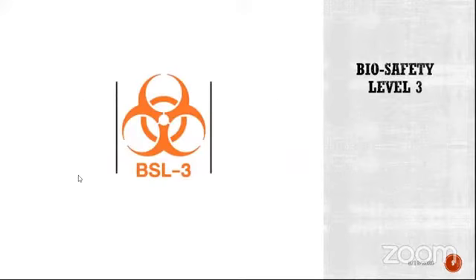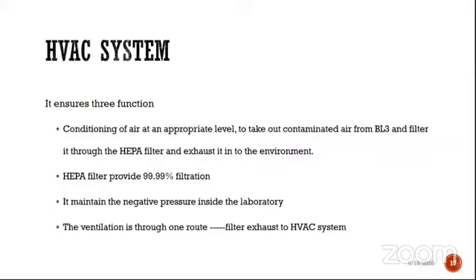We at NIV ICCBS are performing COVID-19 testing at the BSL-3 facility. So, I will briefly discuss the HVAC system, which is a major component of the BSL-3 facility. This HVAC system is the heating, ventilation, and air conditioning system. It separates the potentially contaminated air from the laboratory and maintains negative pressure relative to the adjacent labs. It has the HEPA filter, which provides 99.99% filtration.